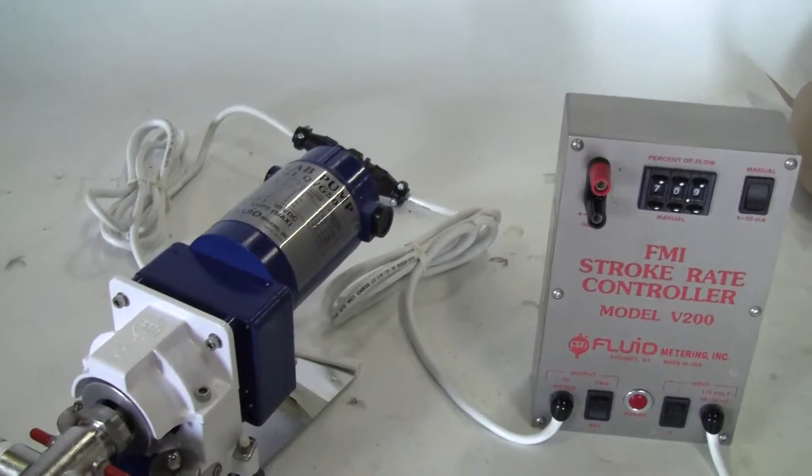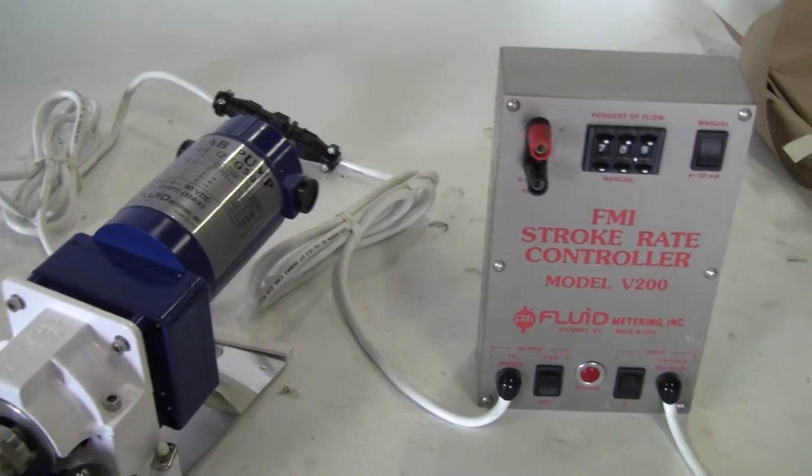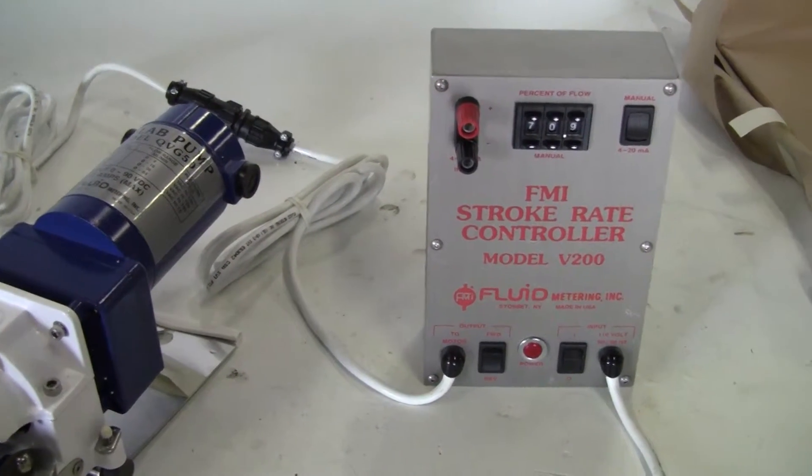Hi, this is Jim from MyTechTrader. Today we have a FMI metering pump, model QV-G50-1.